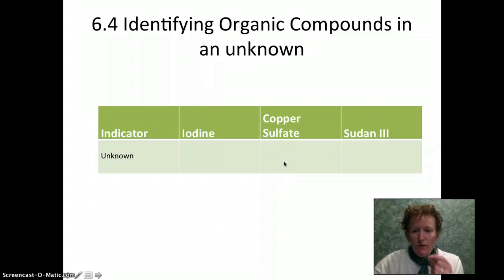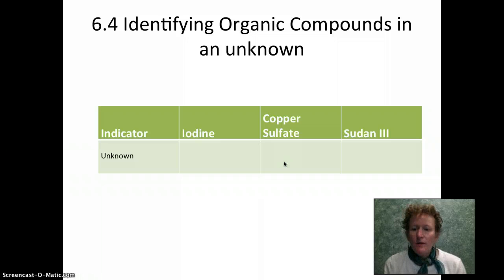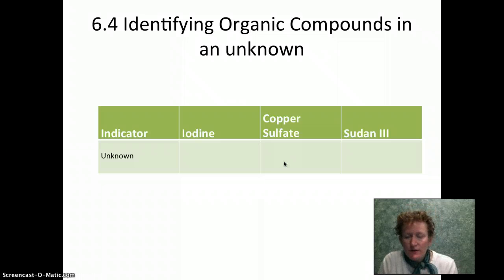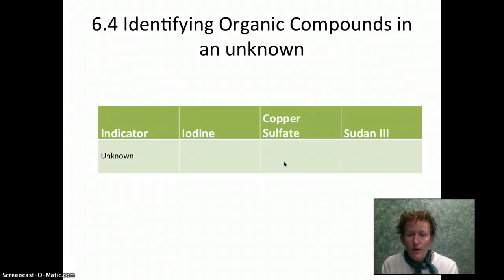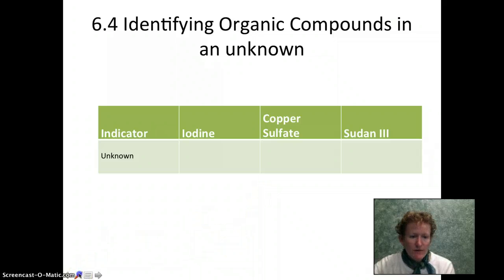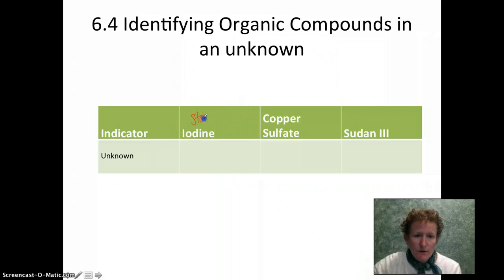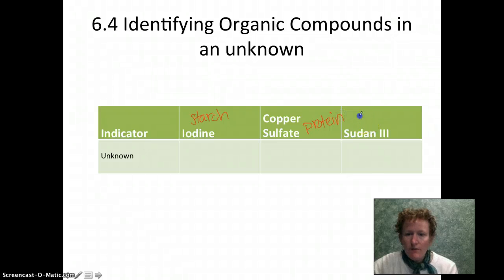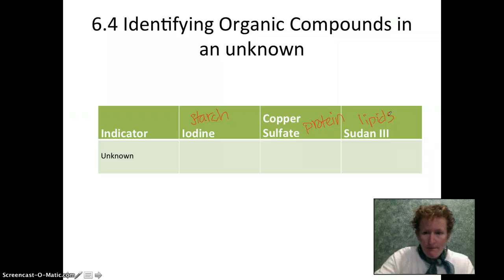Now that we know what the color changes look like - we knew there were lipids, we knew there was starch in the starchy water, and we knew there was protein in the egg white - we're going to take an unknown solution and look for all three macromolecules: starch with iodine, protein with copper sulfate, and lipids with Sudan 3.